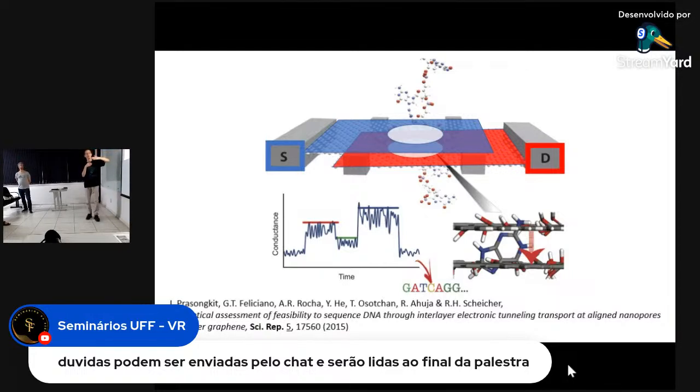That would be unavoidable. But if a DNA strand is moving through, it's a little bit hard to see here, but basically the edge of the upper layer graphene nanopore couples electrically to the base there, and then through the molecular orbitals, it is conducted to the lower part here, and then again it is connecting to the graphene nanopore here. And that gives rise to a much larger current, because always the tunneling distance is much less than the 3.5 angstrom here.